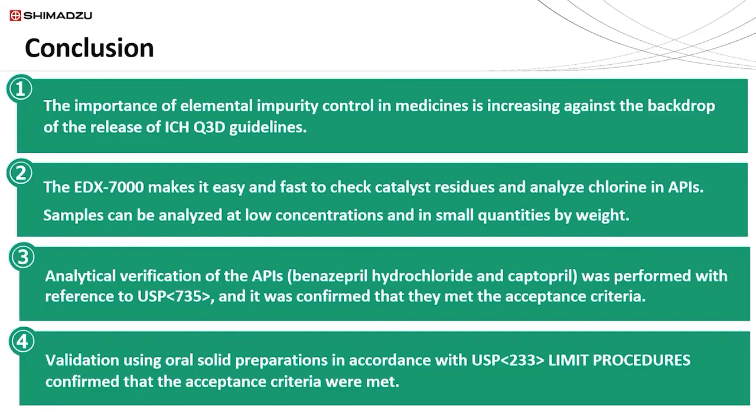We verified 2 different APIs against the criteria specified in USP 735, and the method met those criteria, no problem. And then finally, we used a tablet for validation of an oral solid tablet in accordance with the limit procedure specified within USP 233, and the acceptance criteria was met.